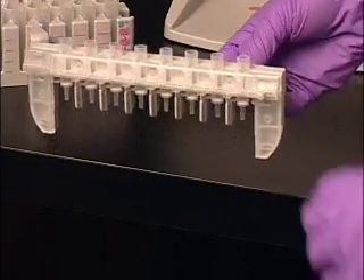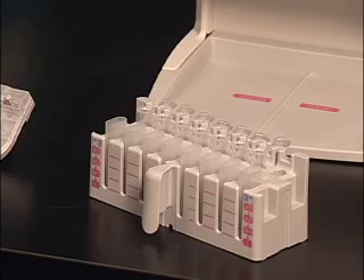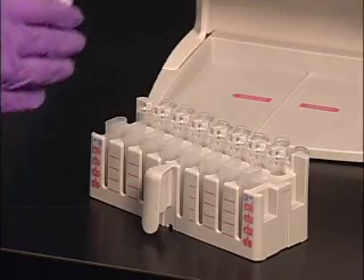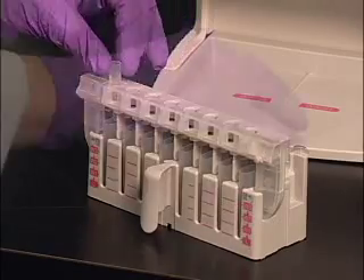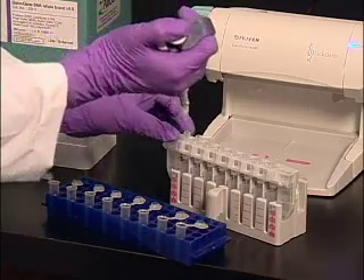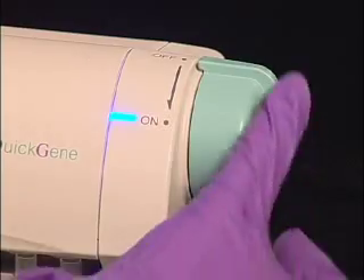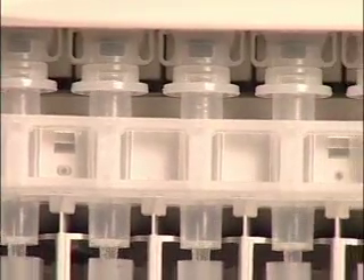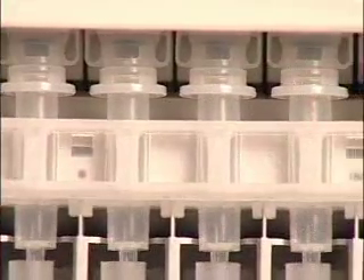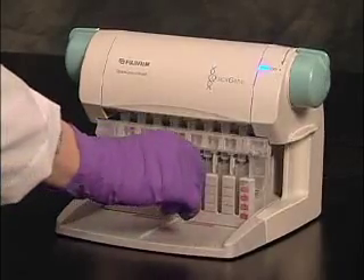The release lever on the cartridge holder allows for easy disposal of used cartridges. Prepare the sample lysate according to the protocol in the appropriate kit. Set the waste and collection tubes into the tube holder, then insert the cartridge holder into the wash position of the tube holder. Set the cartridges into the cartridge holder. Apply between one and eight lysate samples to the cartridges and place the cartridge tube holder assembly into the Mini 80. Turn the rotary switch to the on position to apply air pressure to the cartridges, making sure that the lysate is discharged completely, then return the rotary switch to the off position.